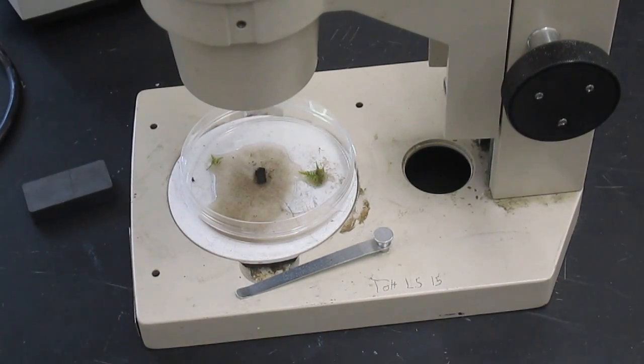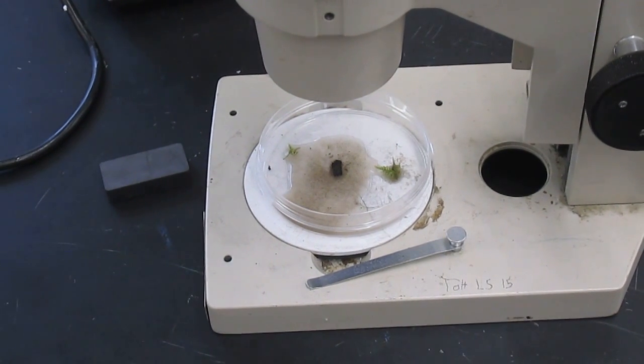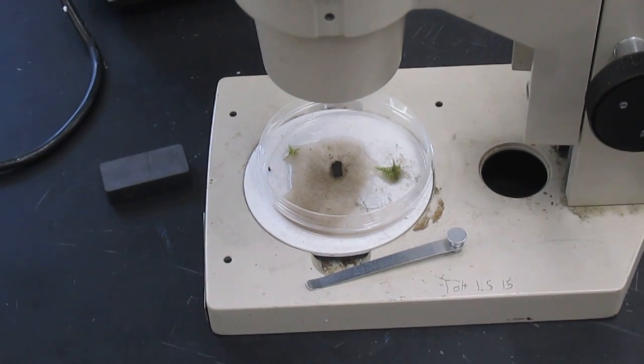Look for little creatures that can move. Tardigrades have eight legs. You'll also see little slug-like things called rotifers, and you'll probably also see some clear worms called nematodes. Good luck!